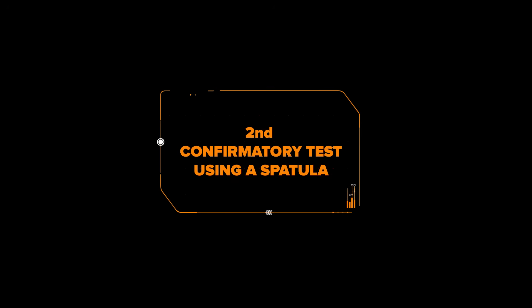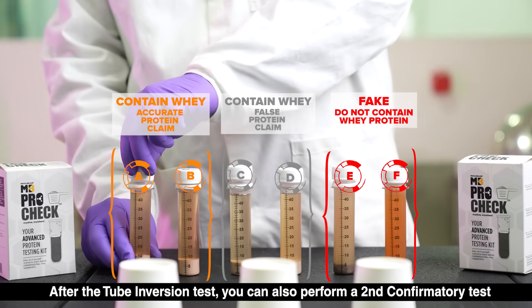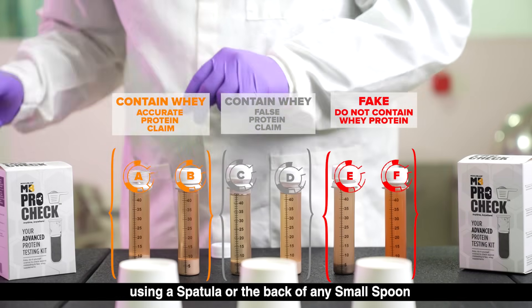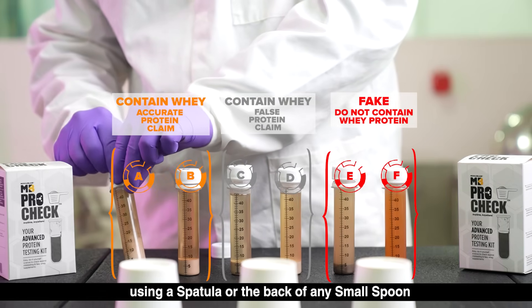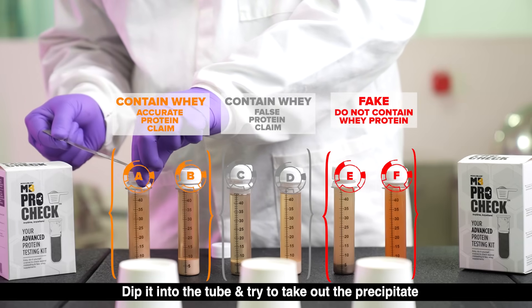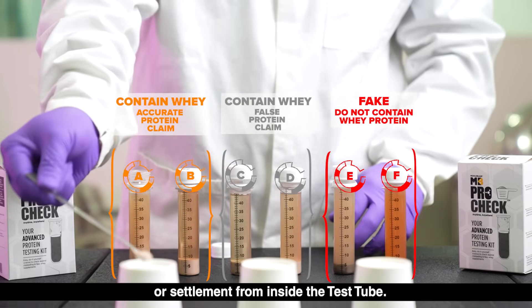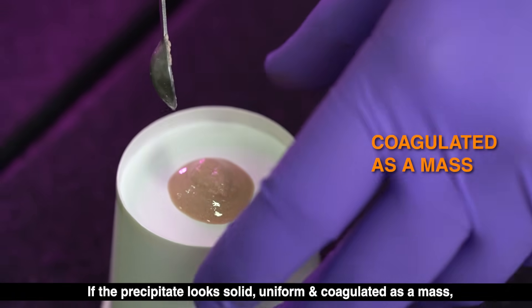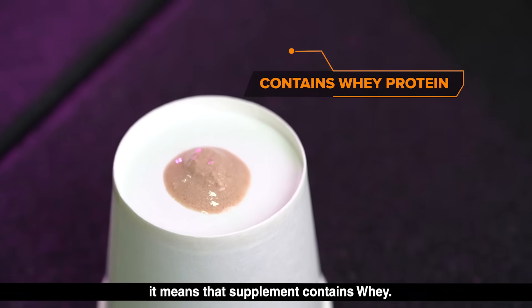18 to 24 hours later, after the tube inversion test, you can also perform a second confirmatory test using a spatula or the back of any small spoon. Dip it into the tube and try to take out the precipitate or settlement from inside the test tube. If the precipitate looks solid, uniform, and coagulated as a mass, it means that supplement contains whey.